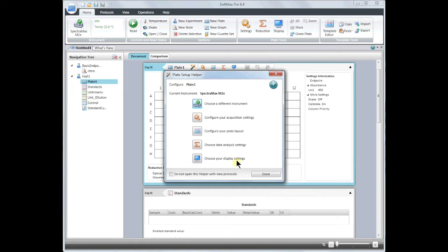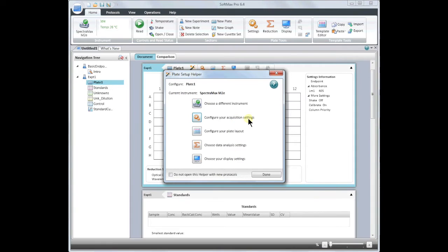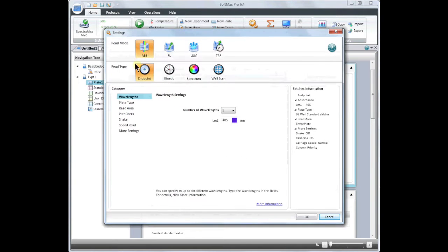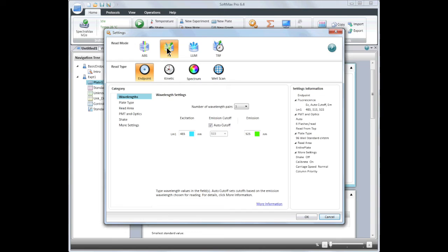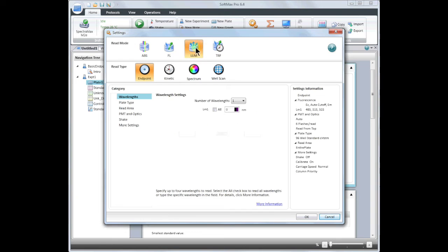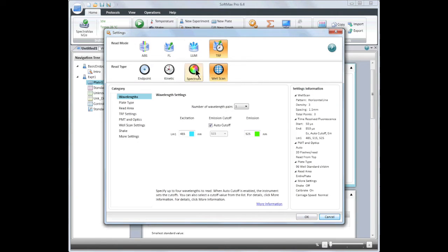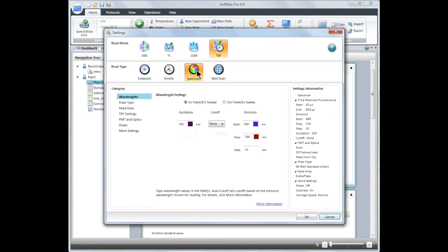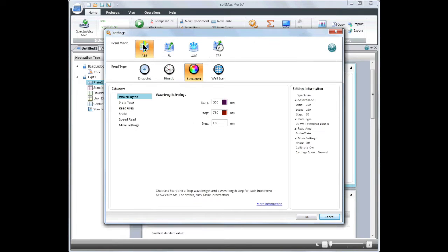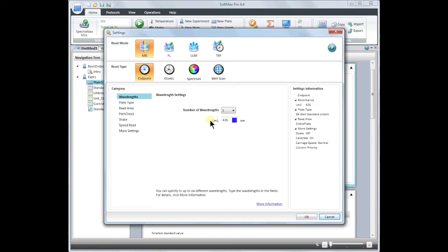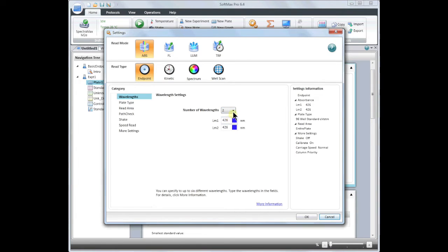This will bring us back to the Plate Setup Helper. Next we will configure the acquisition settings. In the settings window, you will see the different read modes available to you, as well as the different read types. In this example, I will show you an absorbance read that is taken at one endpoint. I will have two wavelengths, one being the wavelength of interest and the second being a reference wavelength. To do this, select the number of wavelengths.